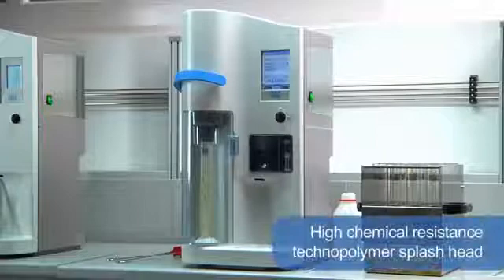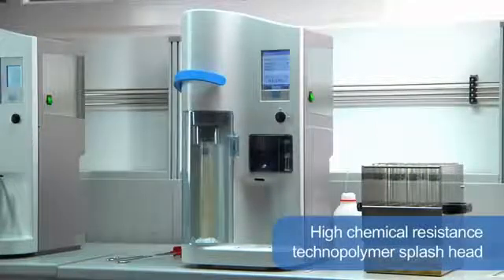The high chemical resistance technopolymer splash head is the most durable design available.